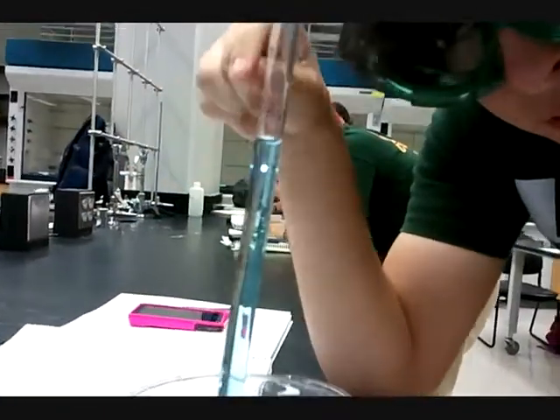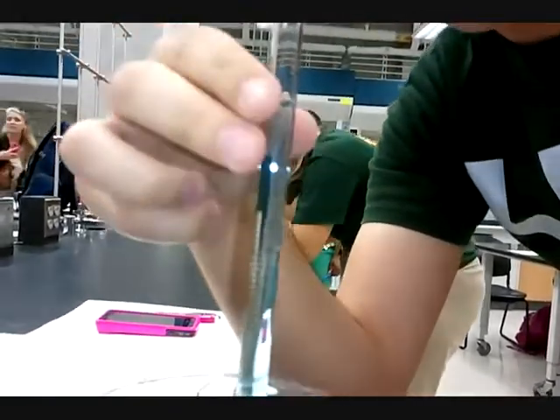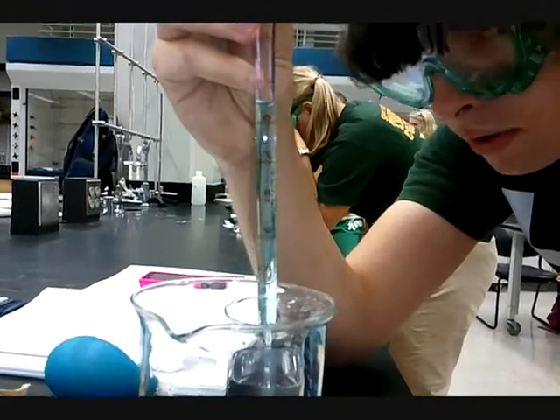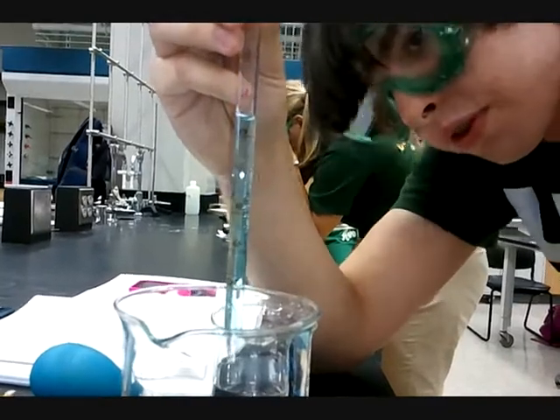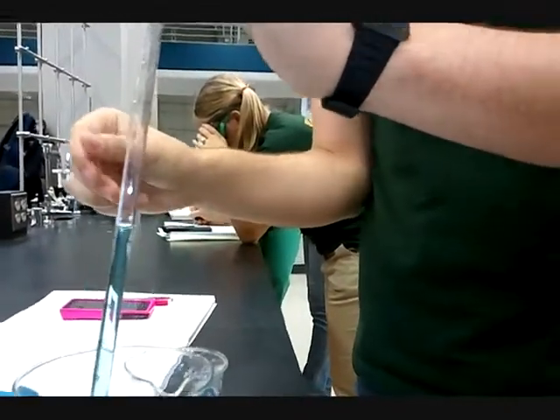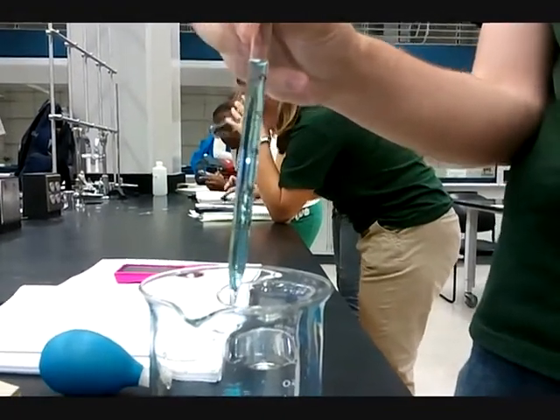The meniscus, I don't know if you can see it, is the curvature of the upper surface of standing water. We took in about 30. No, sorry, about 45. 44. So 44 is the initial.